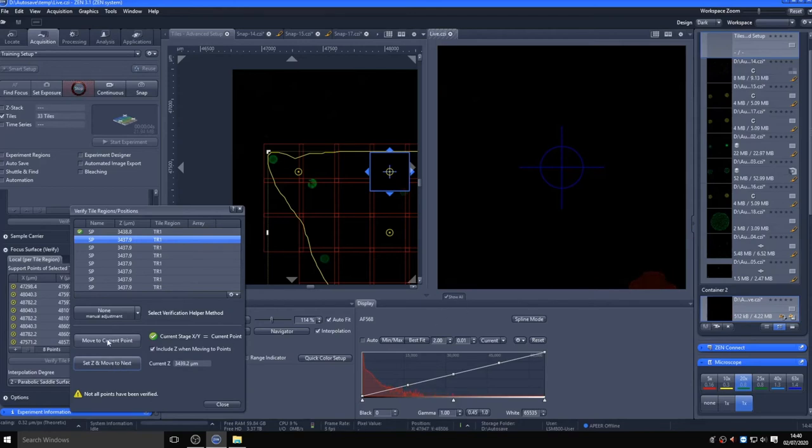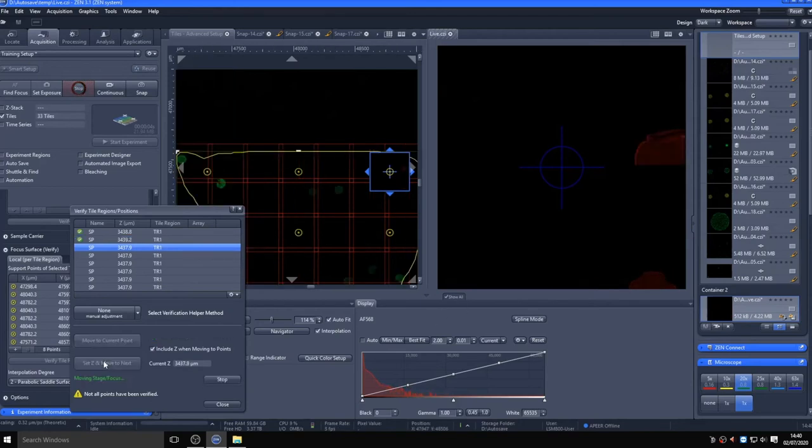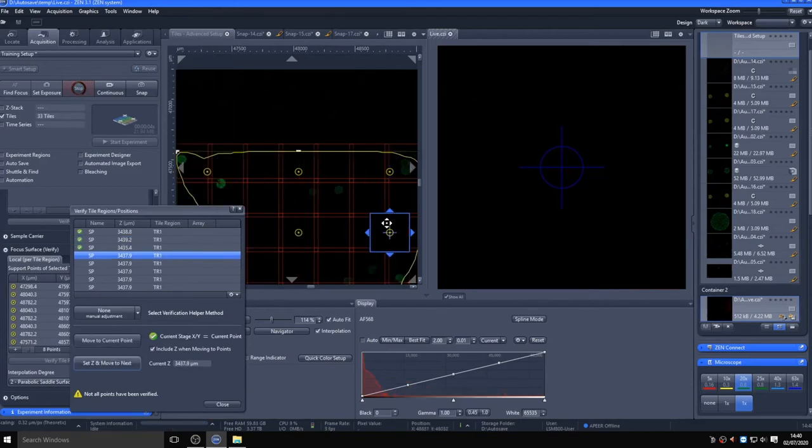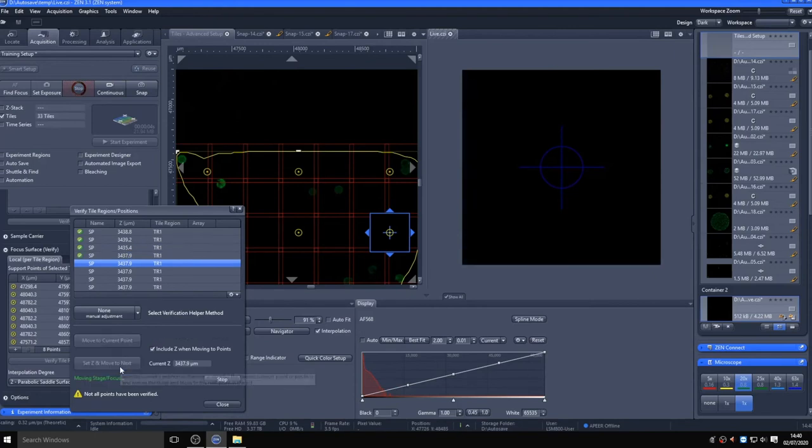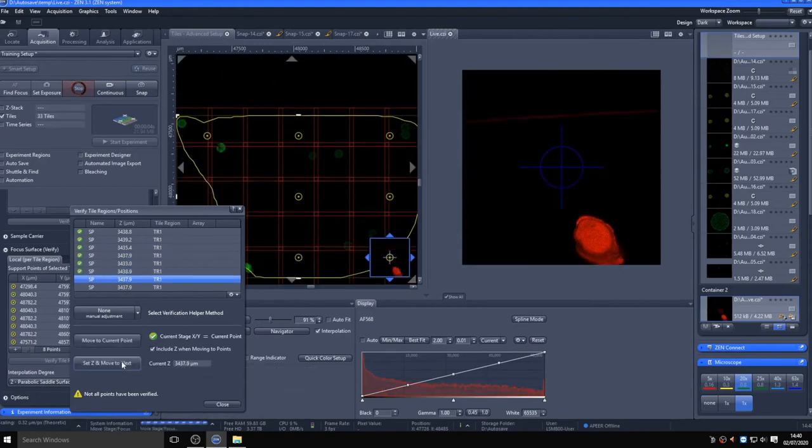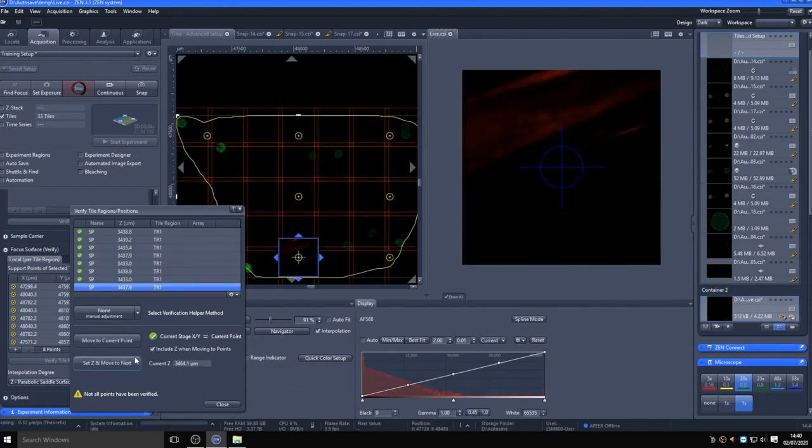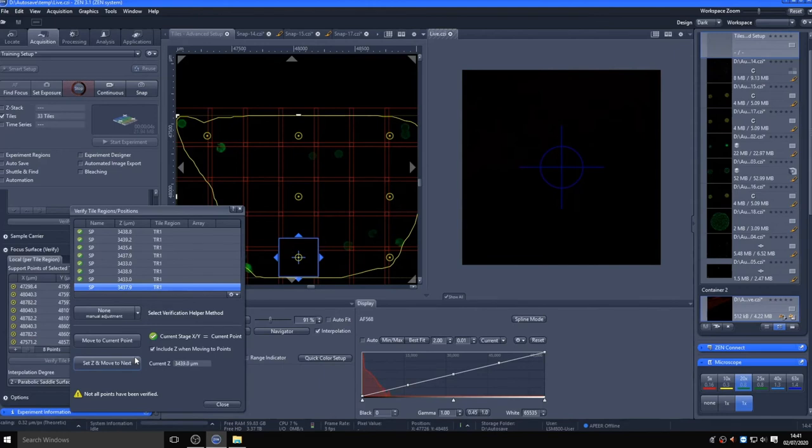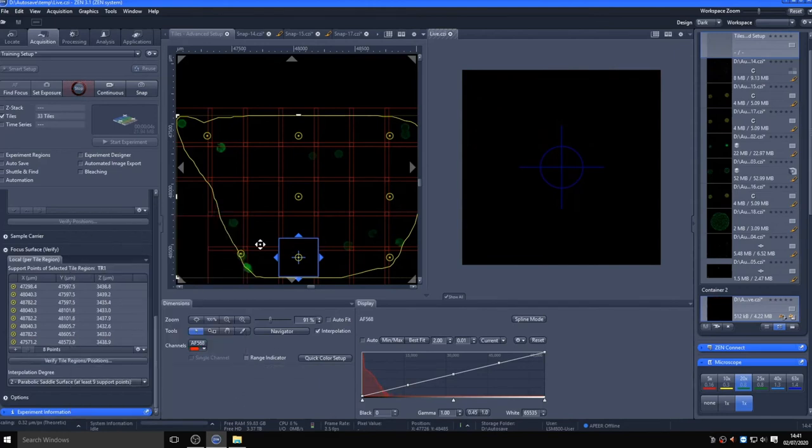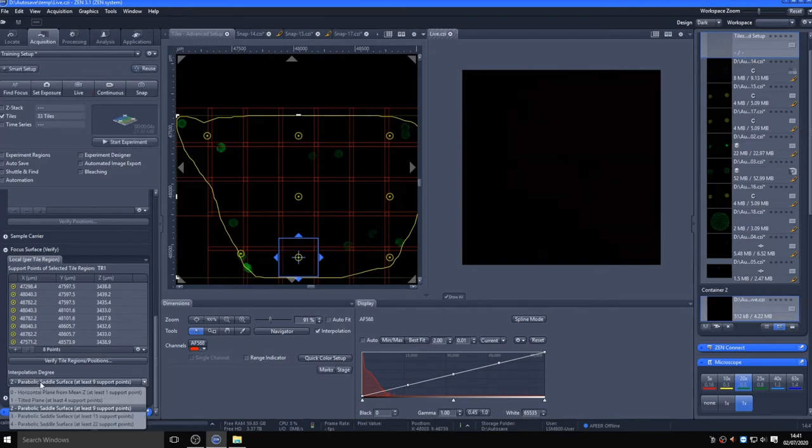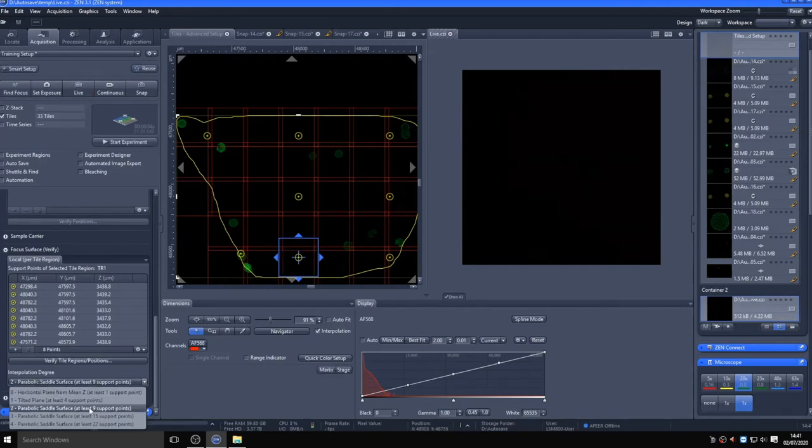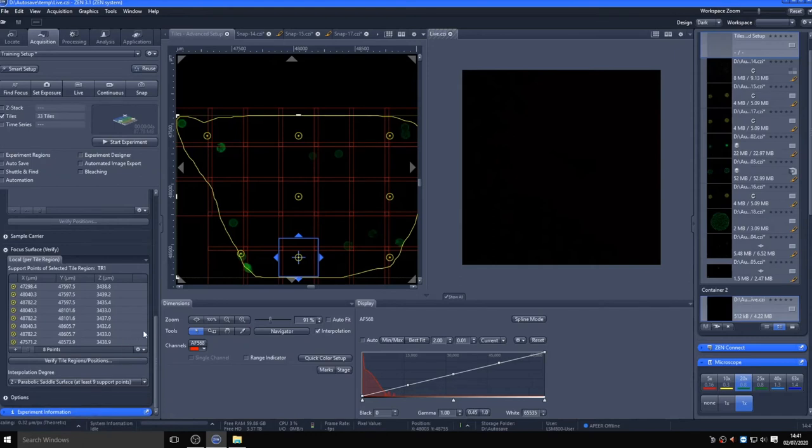Now these will be used to extrapolate a surface map of the region to try and ensure you maintain focus across the sample. Once the positions are all verified, you can choose the extrapolation method, though default is usually pretty good. Looking at the focus strategy, check it is set to use focus surface, then you can start the experiment.